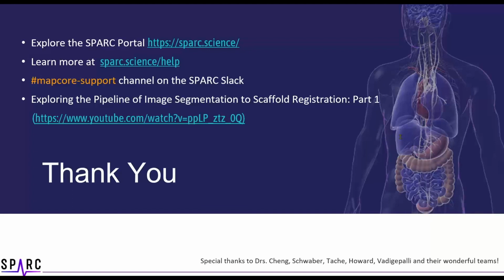In regards to the heart, is there a scaffold comparing the ICN between rat and human readily available? At this stage, we don't have that data available. Currently available on the SPARC portal is the data set I showed here, which looks at different specimens from the rat species.